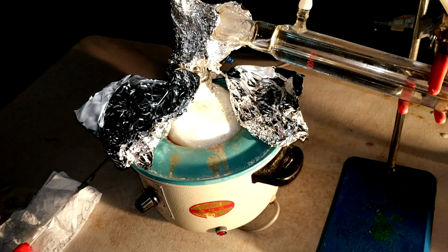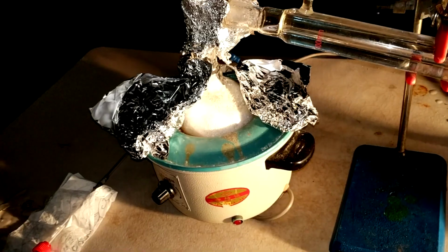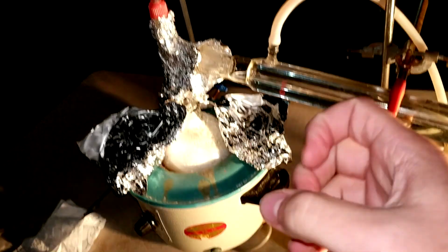So we're running into a slight problem where the solid seems to sublime quite easily, so it's kind of filling the top of the flask there. It's not clogging it because it's quite loosely packed.